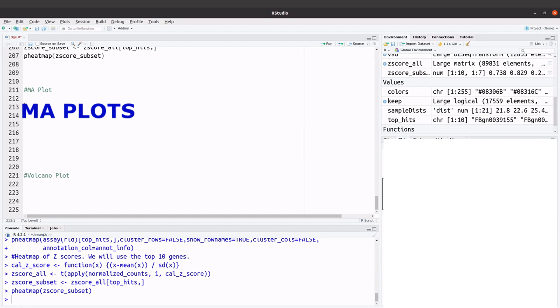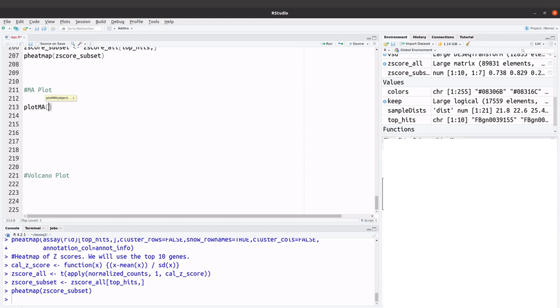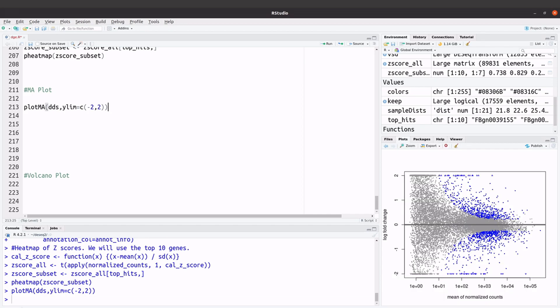If you're using DESeq2, you will have to use the plotMA function to generate your MA plot. We say plotMA and then specify the DESeq2 object, which is dds. Let's add the y limits — we will use negative two and then two. Let's execute this command. Now we have our MA plots.